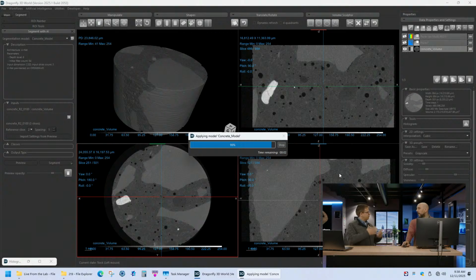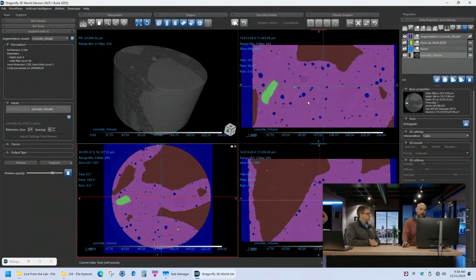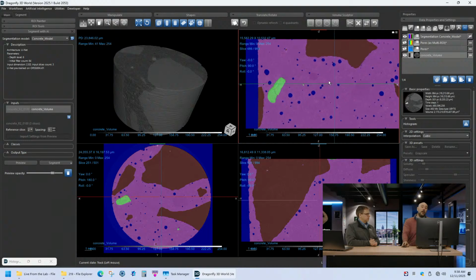It's like these self-driving cars. Where they just have to keep presenting it more and more data. And I like to tell people, just make sure any of your slices that you're training your model on, you want to make sure that it has all of your phases in there, whatever all of your phases is.